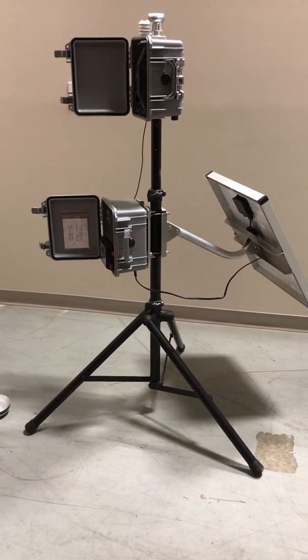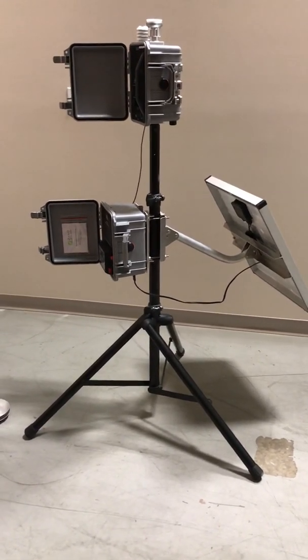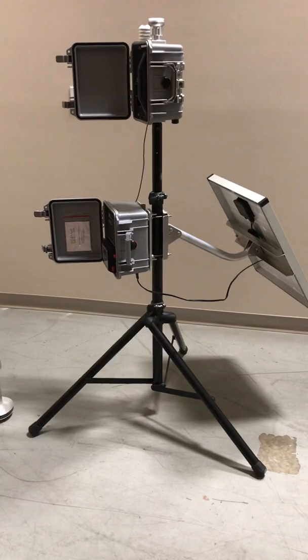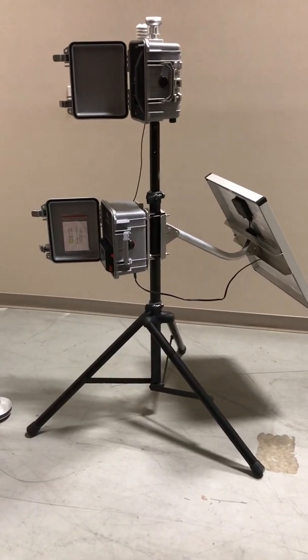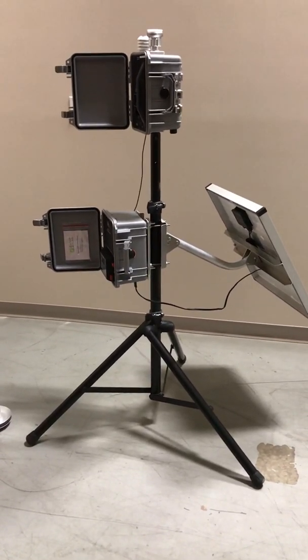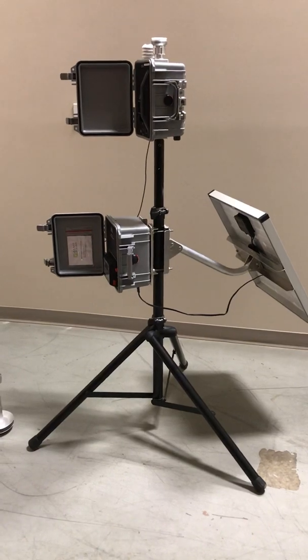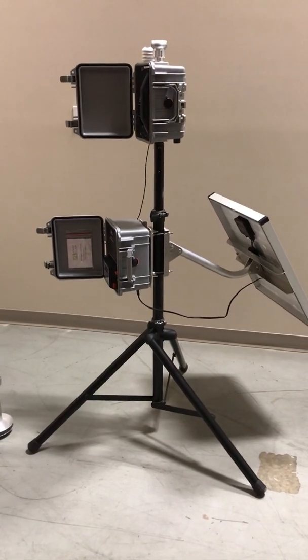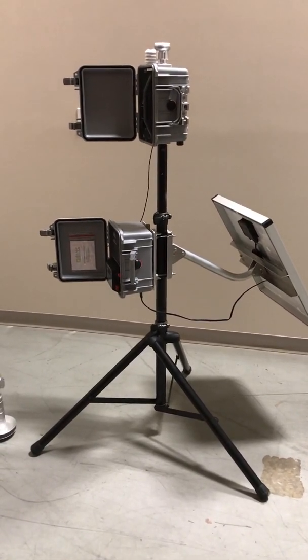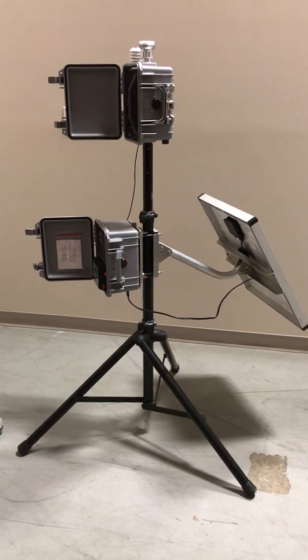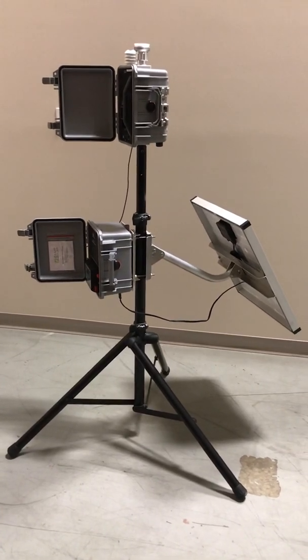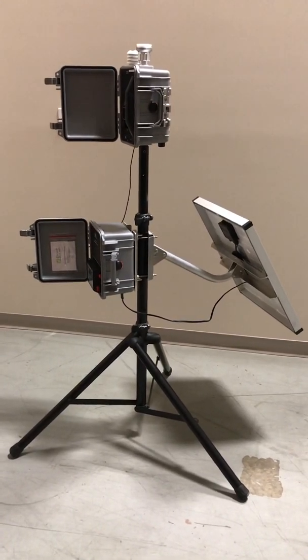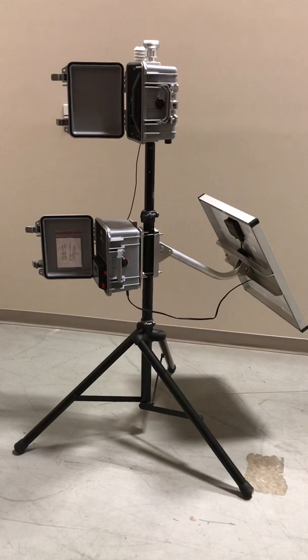Hi everyone, Jim with CD Nova Instruments again. Today we're looking at the ARA Instruments Particulate Monitor for filter sampling. This will sample onto a flat 47 millimeter filter, the kind commonly seen used in the NAPS six-day sample program.